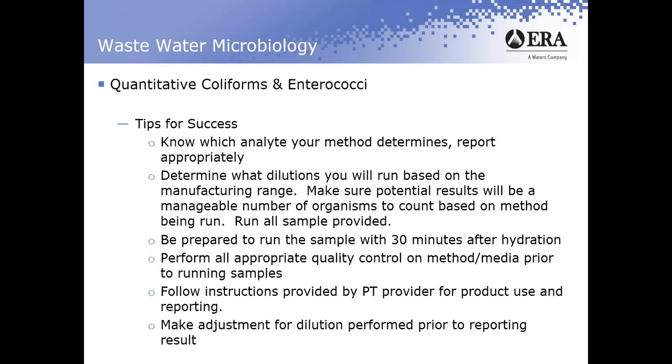Again, run the sample within the appropriate amount of time for the ERA sample. It's a 30-minute period after you rehydrate the pellet that you have to run it. Otherwise, you run the risk of getting some bias into your result just simply because you're not following that instruction. Again, perform all the quality control on the method and the media prior to running the samples.